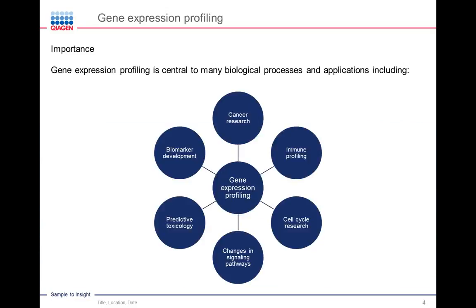So gene expression analysis. We know that gene expression analysis is extremely important and is central to many biological processes and applications, including cancer research, immune profiling, cell cycle research, studying changes in signaling pathways, predictive toxicology, and also for biomarker development.